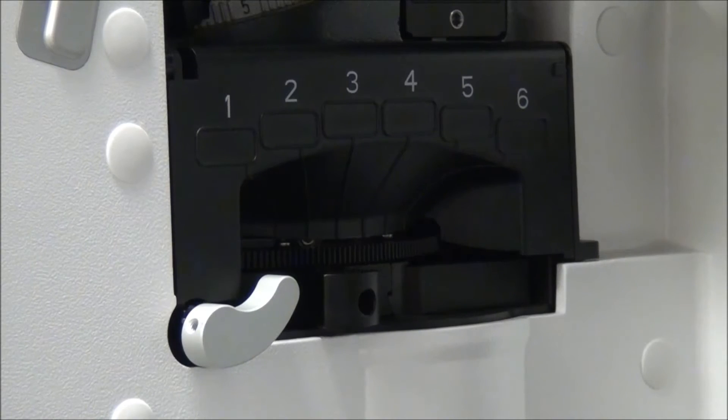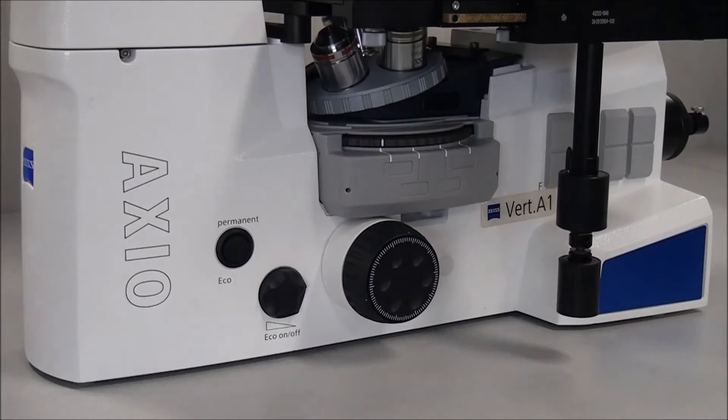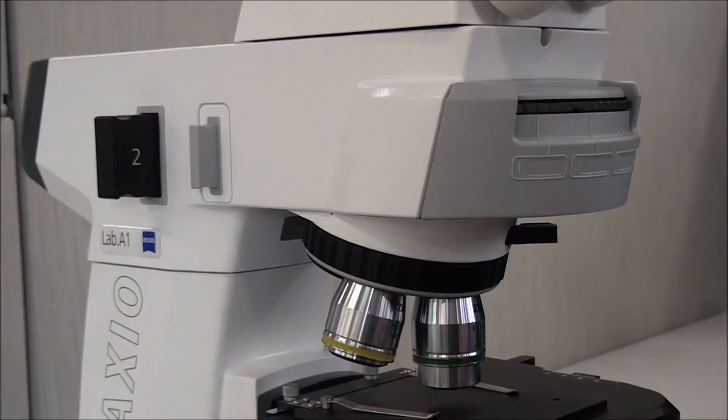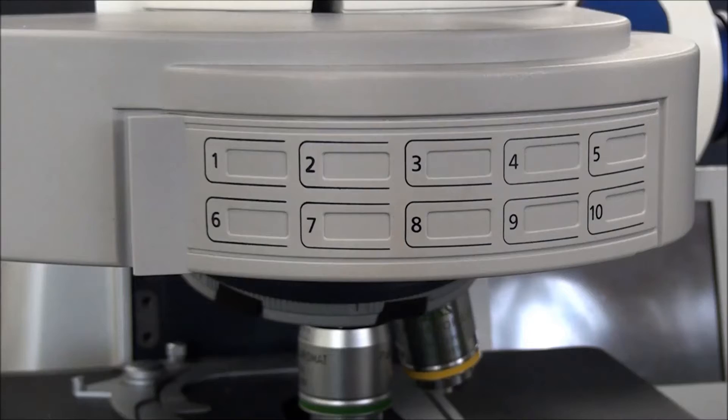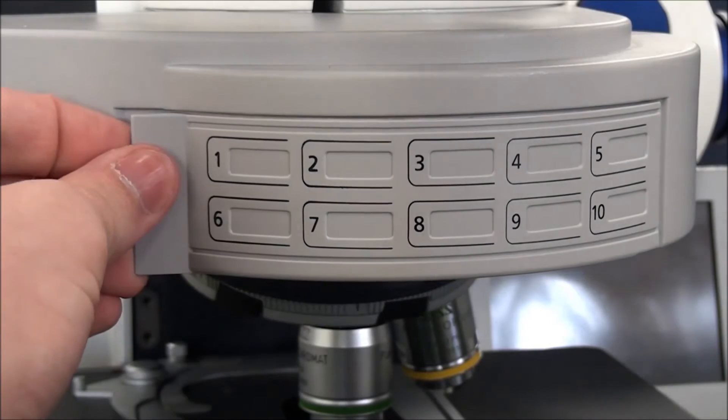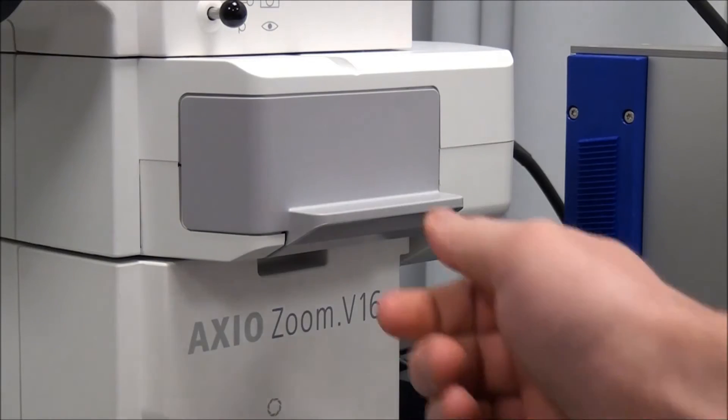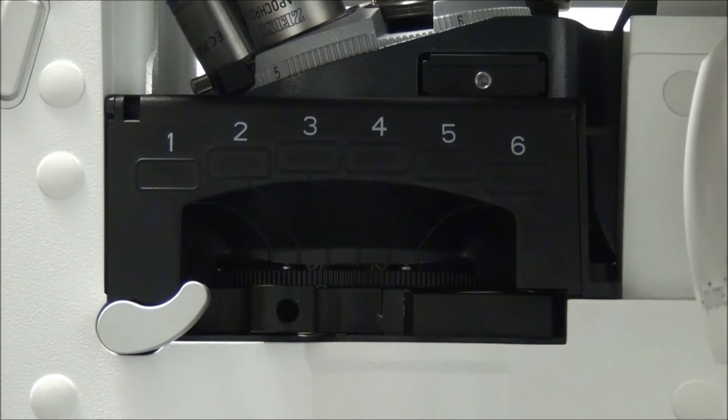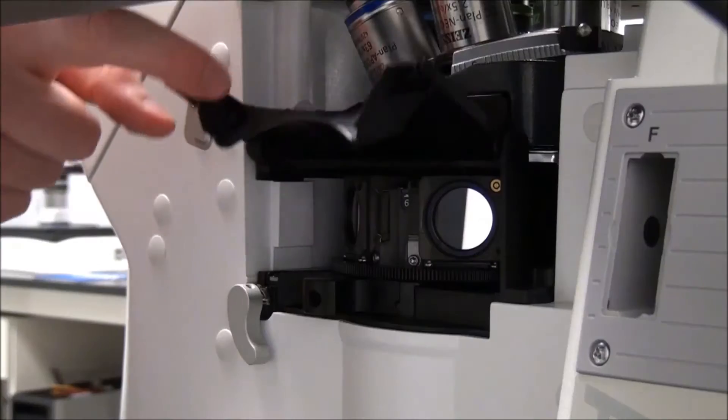Remove the cover or flip open the access panel. There are a few variations. On Axio Vert A1 and Axio Lab A1, pull the door straight off. On Axio Imager, gently pry open the access door. On Axio Zoom V16, pull the gray door straight out. On Axio Observer, first flip down the teardrop-shaped locking lever before opening the access panel.